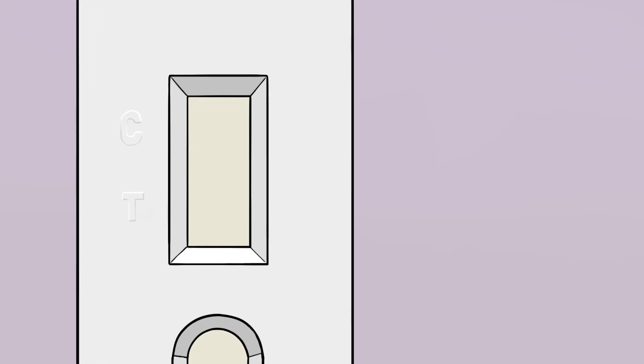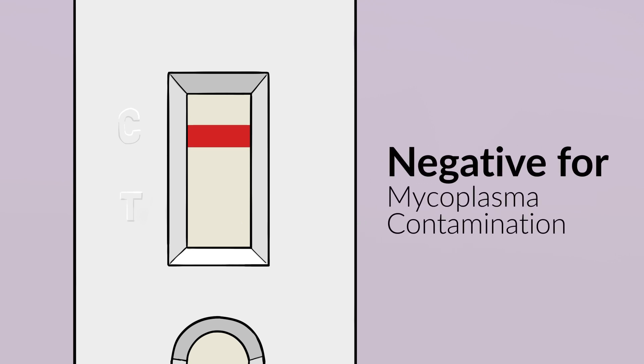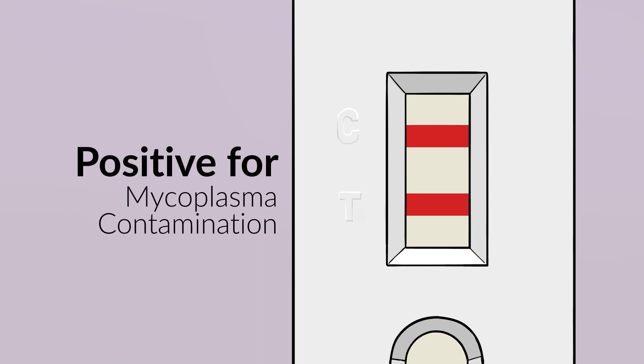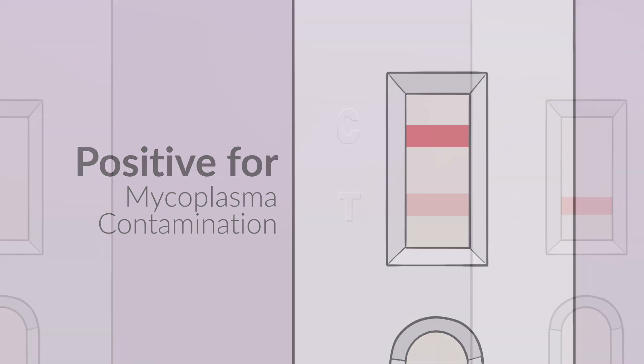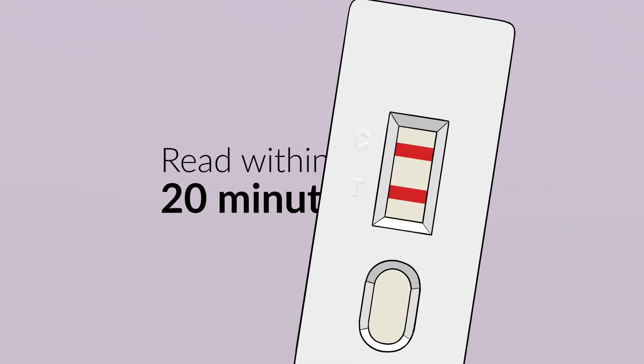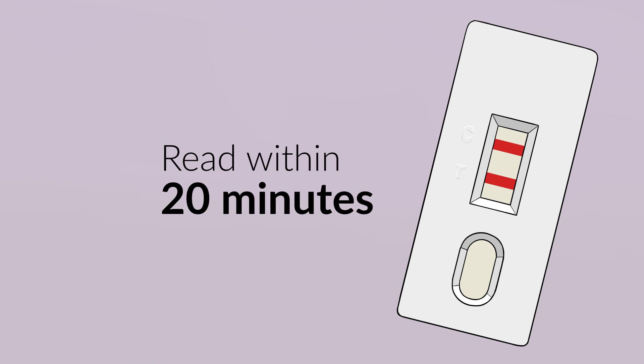If you see one band, the C-band only, it indicates that mycoplasma is not detected. If you see two bands, the C-band and T-band, it indicates that the test is positive for mycoplasma contamination. A faint T-band also indicates a positive test. No control band indicates the test is invalid. The bands will appear within 5 minutes. Be sure to read the results within 20 minutes after buffer loading.